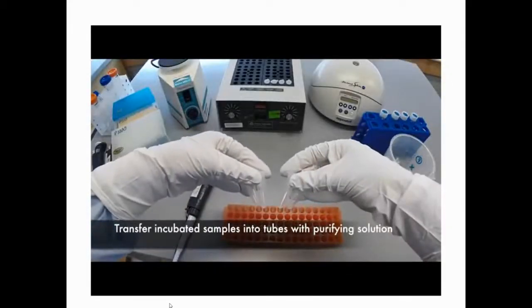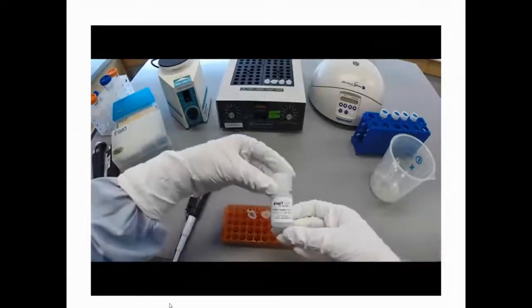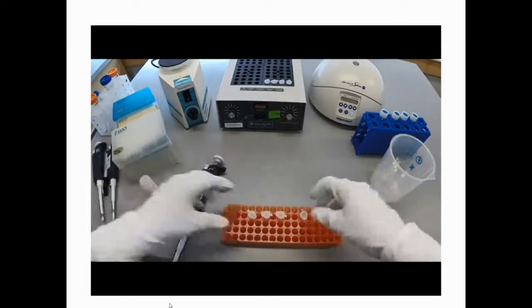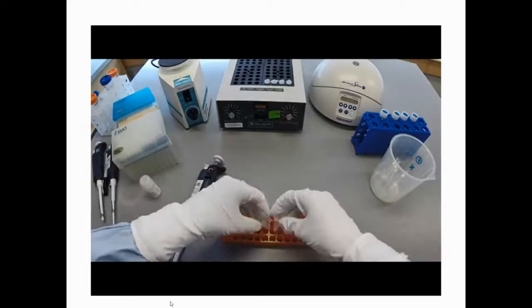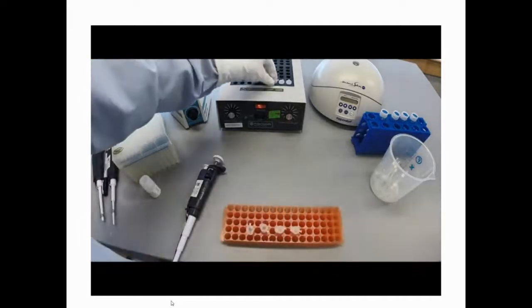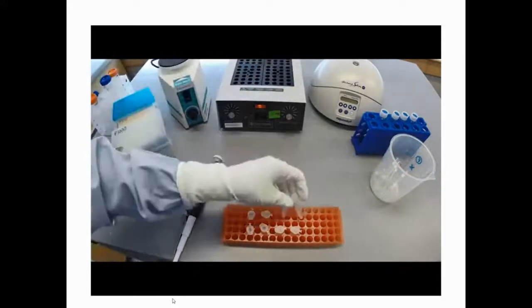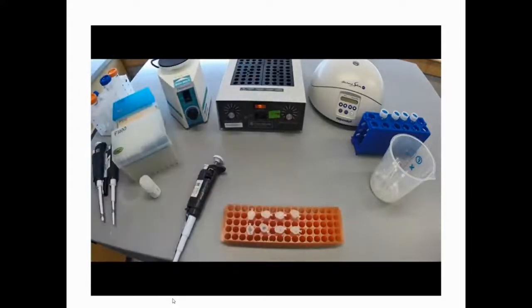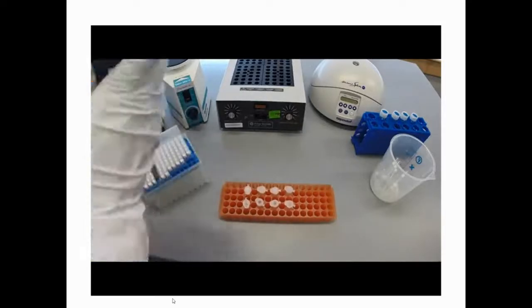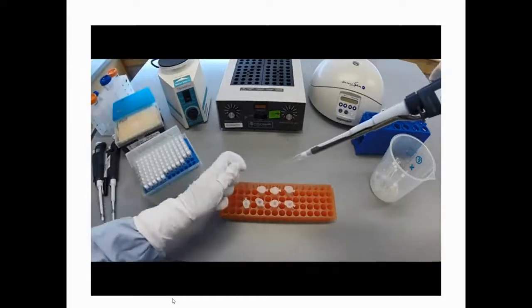Tubes containing 20 microliters of DNA Genotek's proprietary purifying solution, PrepIt, will be provided. The heat block is just to break the cell. Once the samples have been incubated, you will transfer the entire volume to a tube containing the purifying solution.